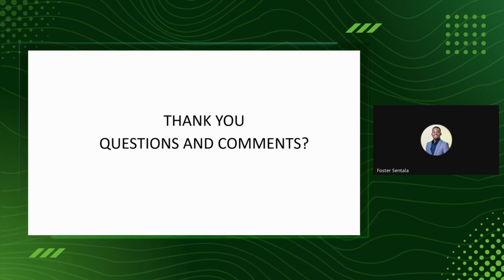All right, thank you very much, Lloyd. Mine is simple and short. I don't know whether I missed it, I was joining from somewhere else. My question is, I understand the bigger models of autoclaves usually offer an option of sterilizing with vacuum. So I wanted to understand what is the actual importance of sterilizing materials with vacuum, apart from just using heat or the normal sterilization process. Thank you.